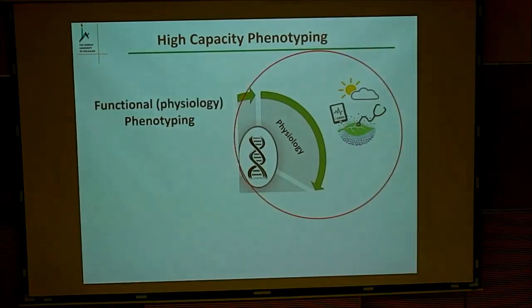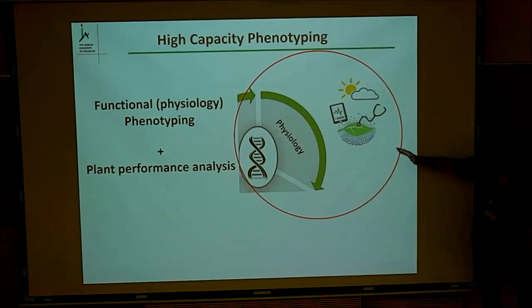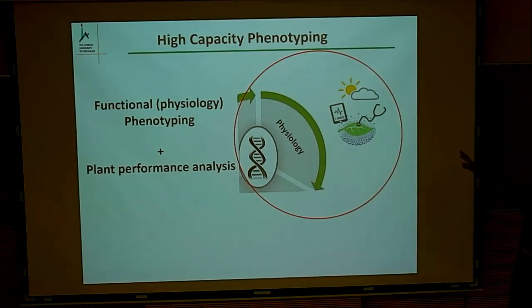When we built our center, we decided to focus on physiological phenotyping, which is a relatively new option, and also on performance analysis. Gathering a lot of data today is easy. The problem is how to get the data analyzed. So one of the tools we are using are computerized tools. I'm not going to demonstrate it. There will be some small demonstration. So if somebody finds more interest in that, please let me know, and I will give them a short brief later.